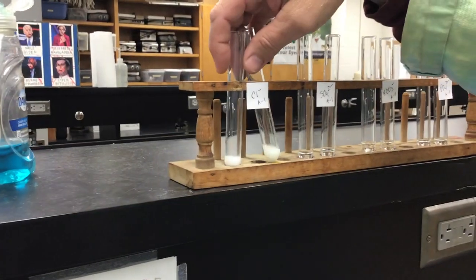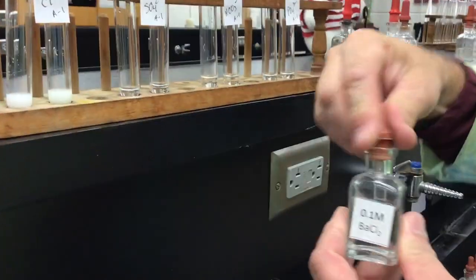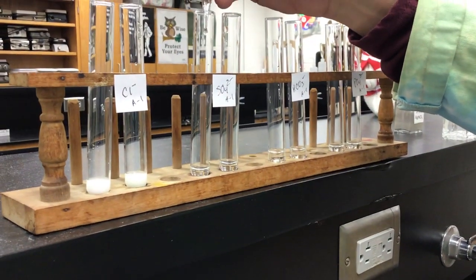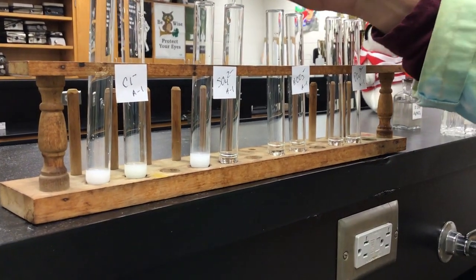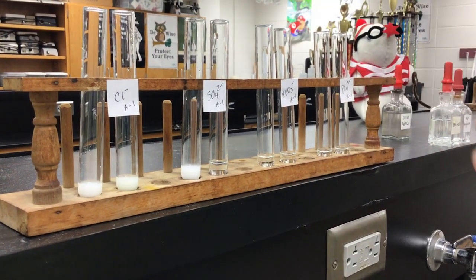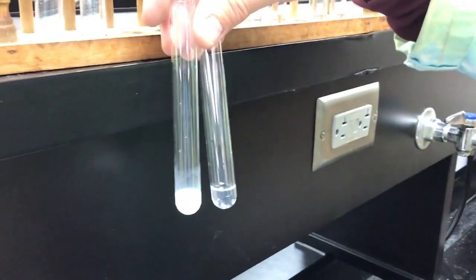Okay, so we're going to set that aside. That was our first test for chloride ions. Now for a test for presence of sulfate ions, I'm going to add barium chloride to the solution. It says, I believe, 1 milliliter, so I'm going to put in approximately 20 drops in there and 20 drops in here. And we'll see if those are the same. Look at them on a colored background. I don't know that we need to spend a lot of time on that one.